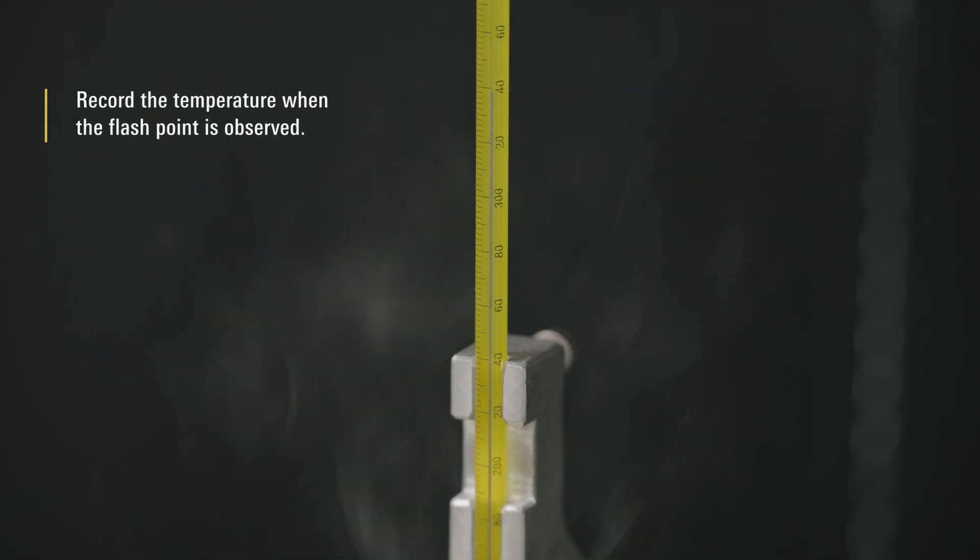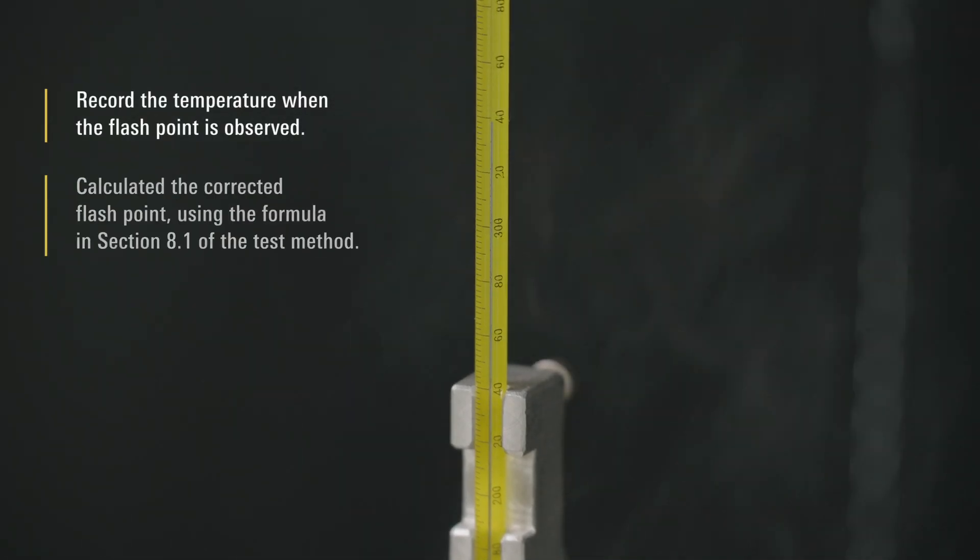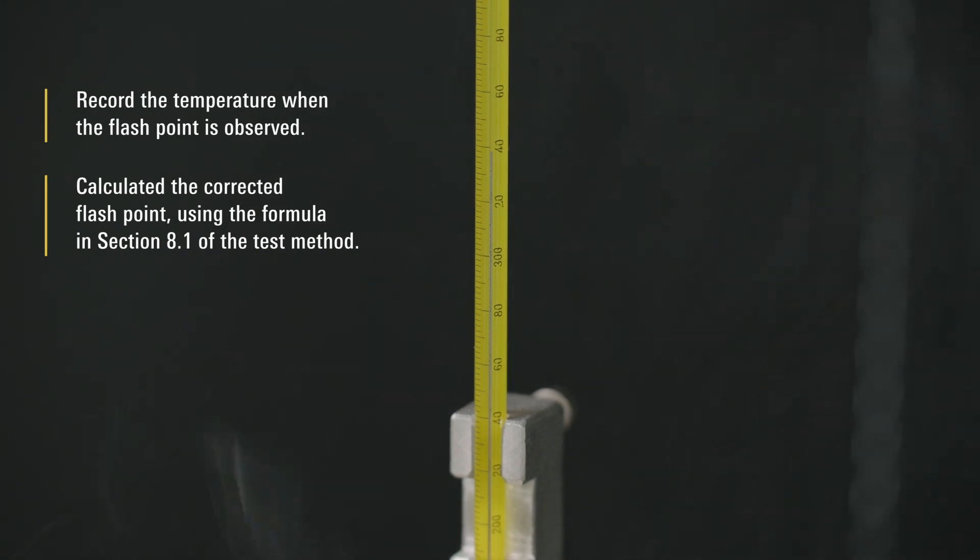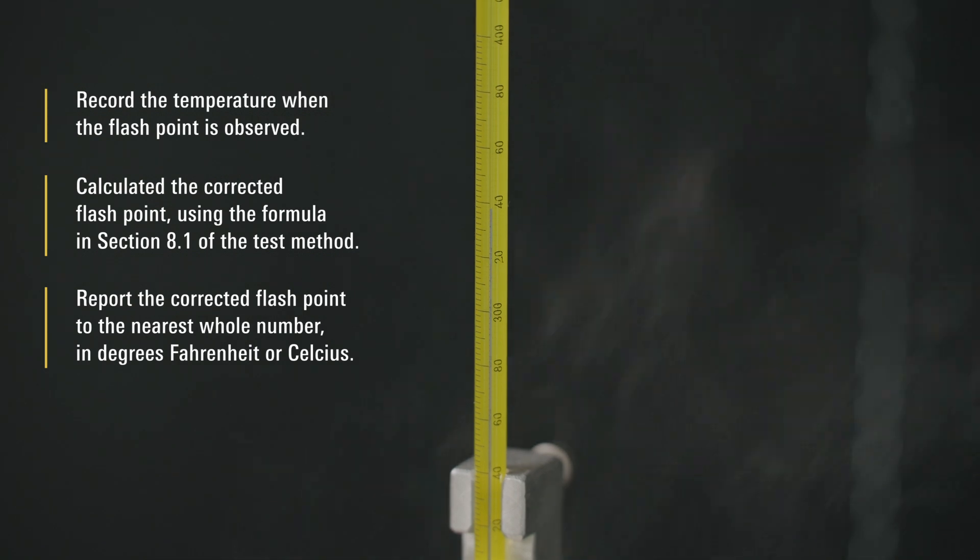Record the temperature when the flash point is observed. Calculate the corrected flash point using the formula in Section 8.1 of the test method. Report the corrected flash point to the nearest whole number in degrees Fahrenheit or Celsius.